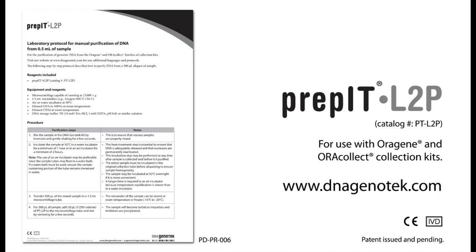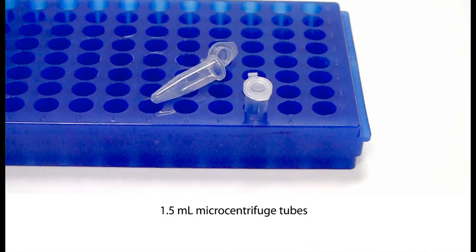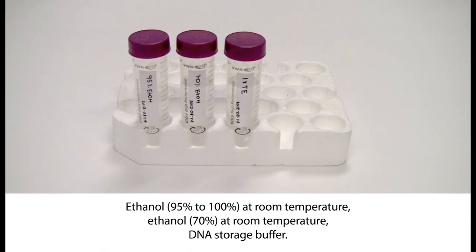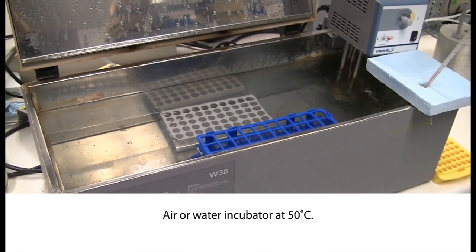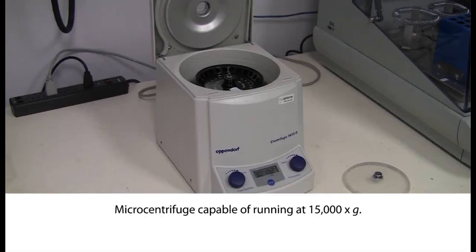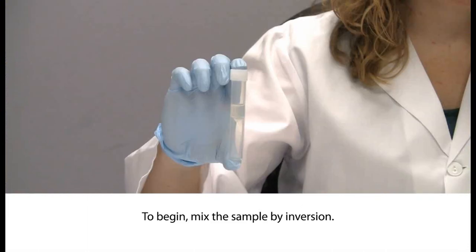This video illustrates how to purify DNA from a 500 µL aliquot of sample. prepIT•L2P is the reagent required for this protocol. The equipment required includes: 1.5 mL microcentrifuge tubes, ethanol 95% to 100% at room temperature, ethanol 70% at room temperature, DNA storage buffer, an air or water incubator at 50 degrees Celsius, and a microcentrifuge capable of running at 15,000 times G.